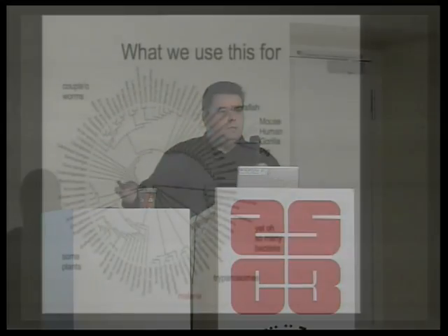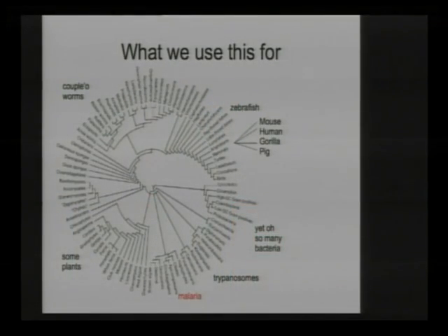So they're now doing zebrafish with a new technology, which has its own drawbacks, because currently these reads are actually too short to reassemble a completely new genome. This will be fixed with the 50 and 100 base pair reads that we're seeing now, that are coming through next month, beginning of 2009. But currently it's basically not possible, because the reads are just too short.